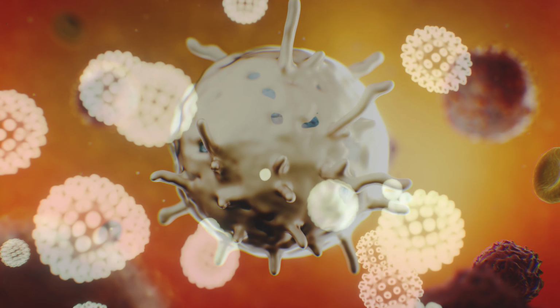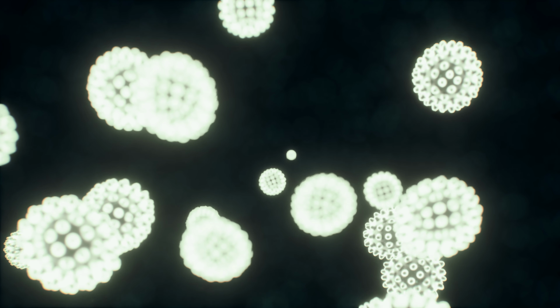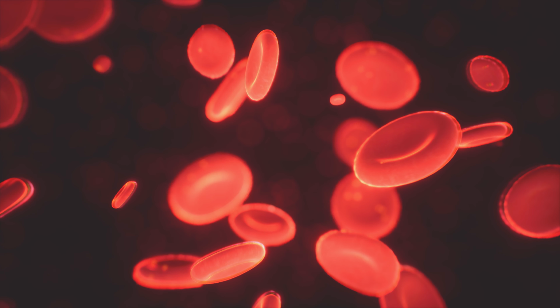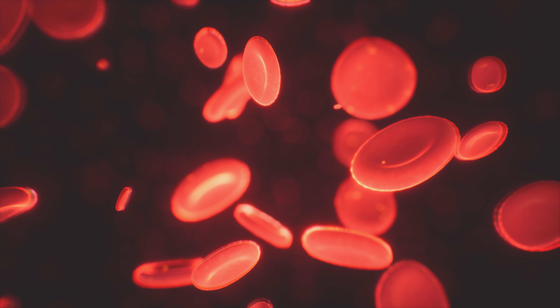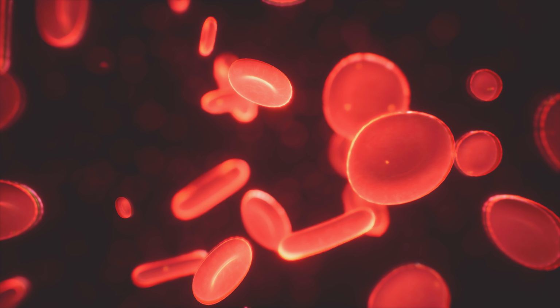All human blood should be treated as if it's infectious for bloodborne pathogens, but several factors influence the risk of infection after exposure, including the individual's health status, the volume of blood exchanged, the virus's concentration, as well as the depth of the cut or penetration.